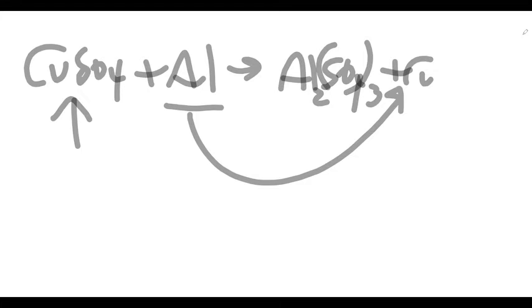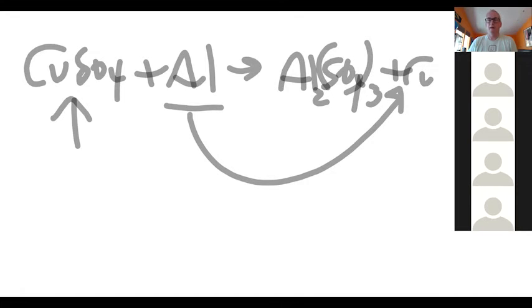Do I need to worry about how much copper sulfate I add? Well, I'm just guessing, but I know in the lab manual it says that you need approximately 100 milliliters of it. But my guess is that it has to be kind of proportional, like comparing it to the balanced equation. Right, it does need to be proportional.